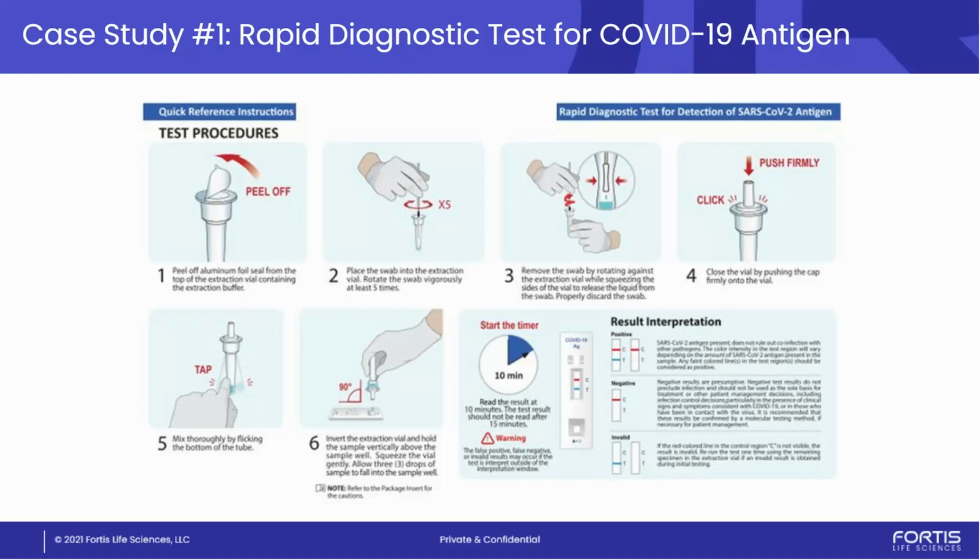Thus, heat sealing and the dispensing of that buffer with precision of plus or minus a microliter, and the heat sealing of that. These machines are very inexpensive. They range from about $25,000 to $200,000, but at the low end, these things do about 2,500 a minute. It can dispense and seal. The next step is the swab, the independent swabs that come in sterile packaging.